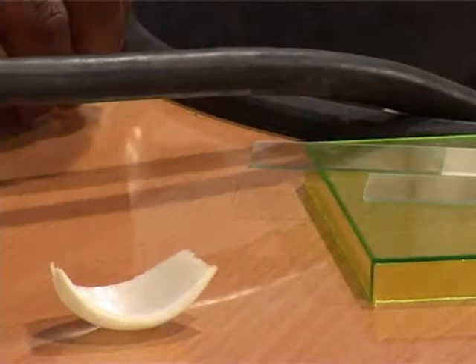Well, learners, let us now demonstrate how you can observe an object using a microscope. Well, learners, we are now demonstrating how to use a microscope. Okay? We are going to use onion, which is a plant. So we want to see plant cells. Okay? So how do you go about it? You get onion and cut it. This one is already cut.